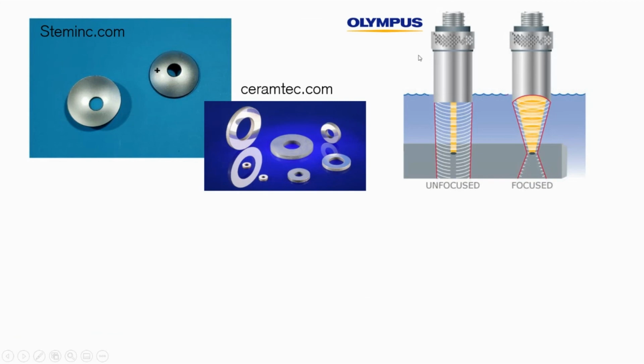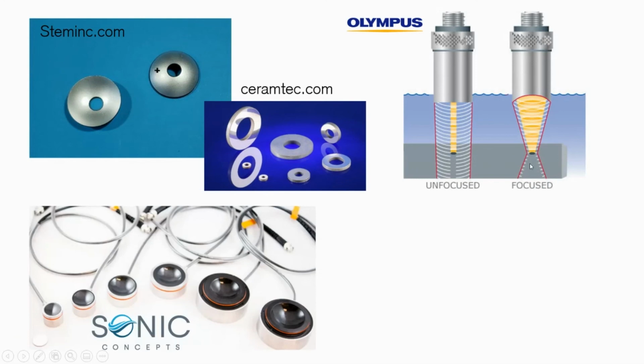Olympus makes a little bit more plug and play transducers. They're immersion transducers. They were really made to detect flaws in material surfaces, I think predominantly plumbing actually. Nevertheless, you can repurpose the focused ultrasound transducers to angle them into the brain, and I can point you guys towards those if you're interested.